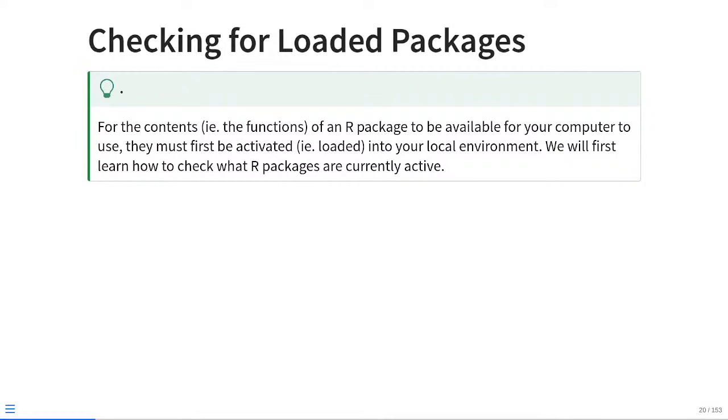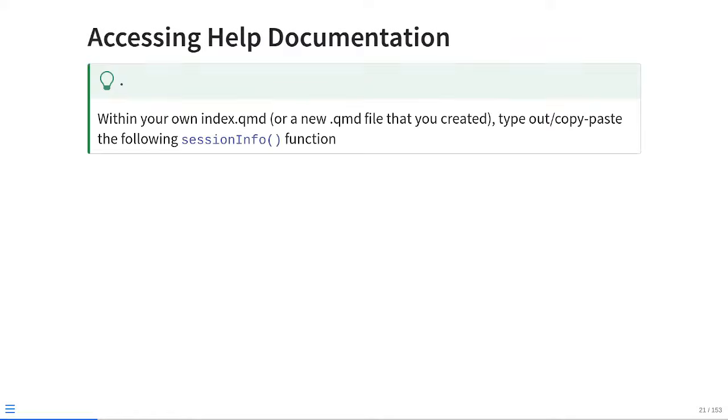So as I mentioned, once we install a package, we need to make sure it's loaded into the local environment when we open Positron or any of our IDEs that we may be using. That makes it active and allows the computer to see what functions, i.e. what tools, are present, so it can then use them in turn.